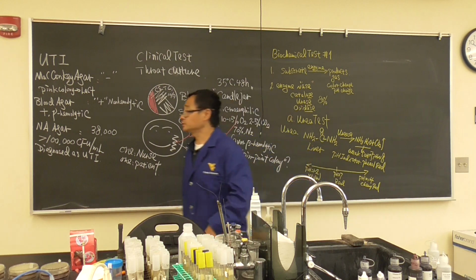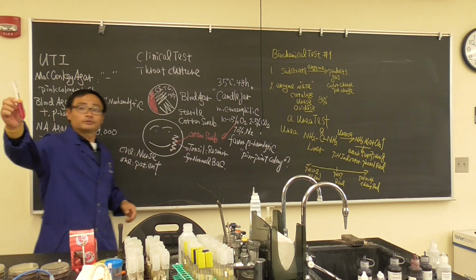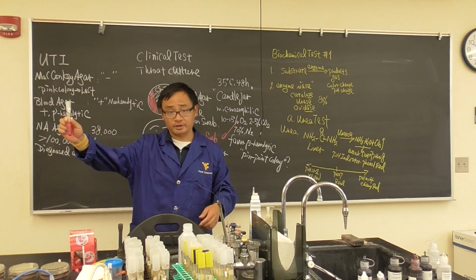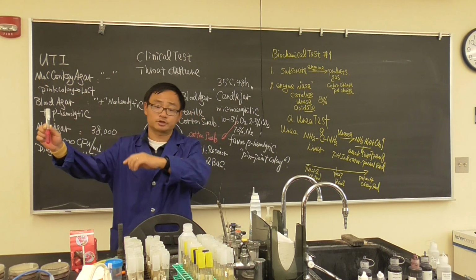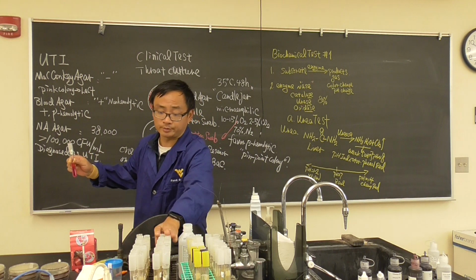Now how we do it is very simple. You have 1 urea tube like this, and then use a cotton swab to pick the bacteria. Can you please double check the bacteria? Is there incubation, do they have bacteria? They're going to be doing these, okay?